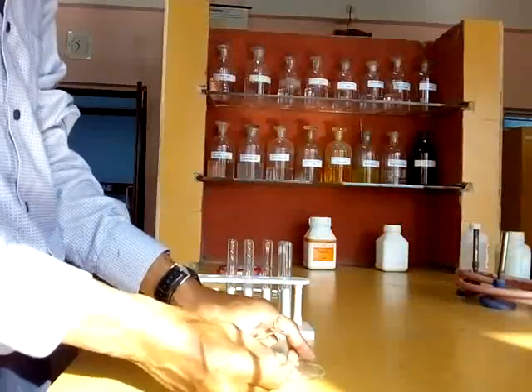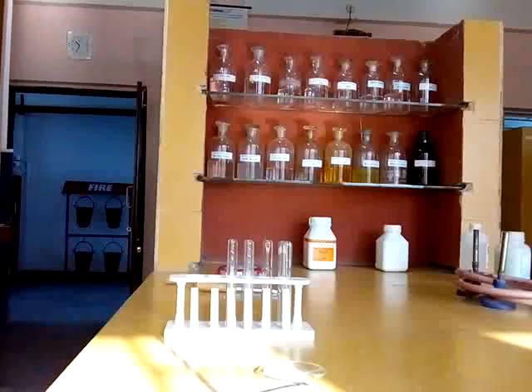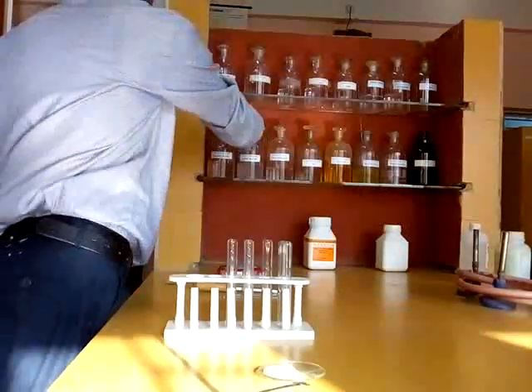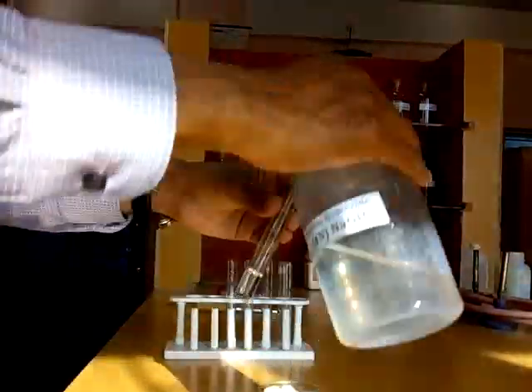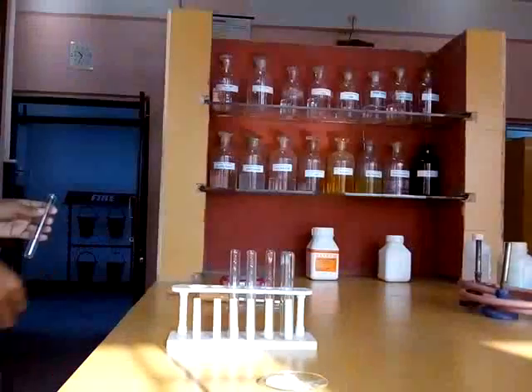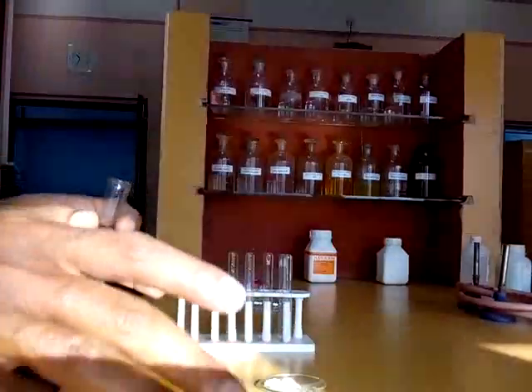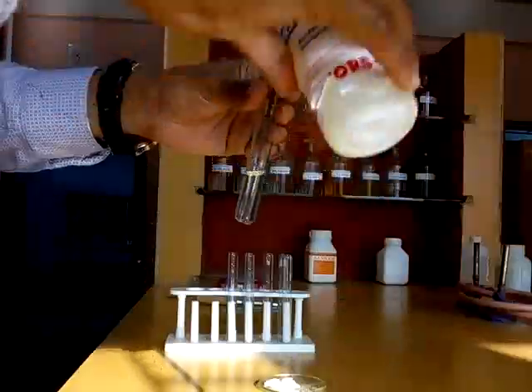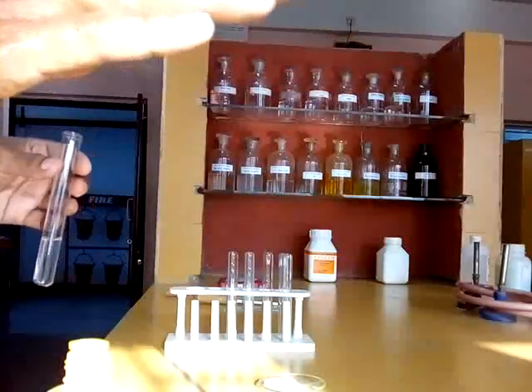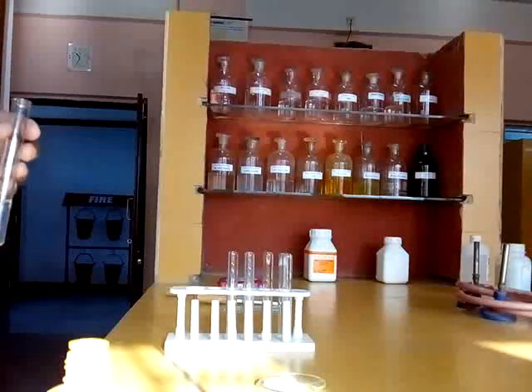First we have to prepare salt solution, then we add sodium hydroxide solution. This is sodium hydroxide, and after that we have to add Nessler's reagent. After adding Nessler's reagent, if you get brown precipitate, then it is confirmed that group 0 is present. If you get other colored precipitate, white precipitate or yellow precipitate, then it is not group 0.